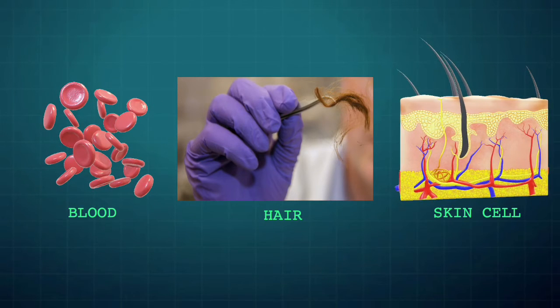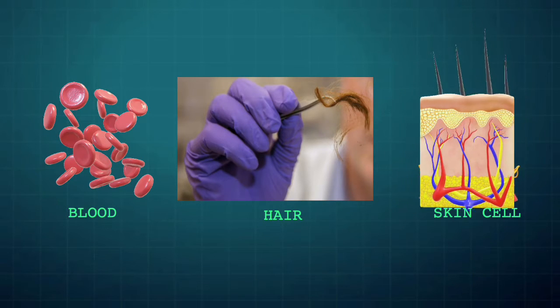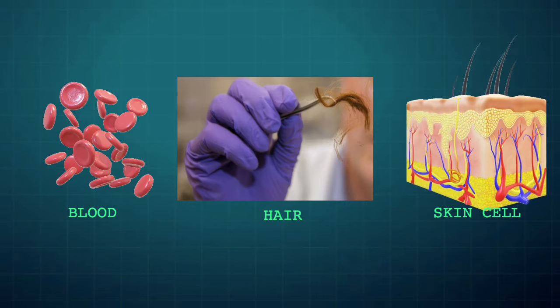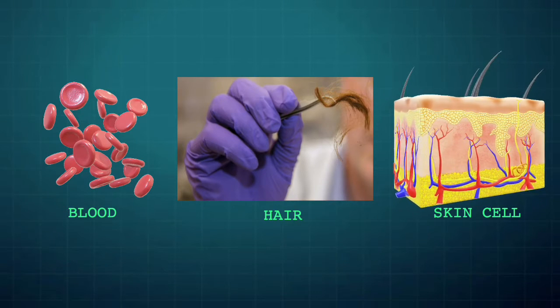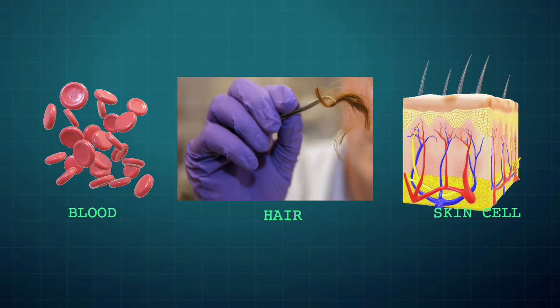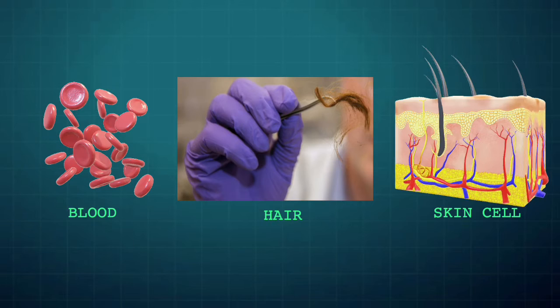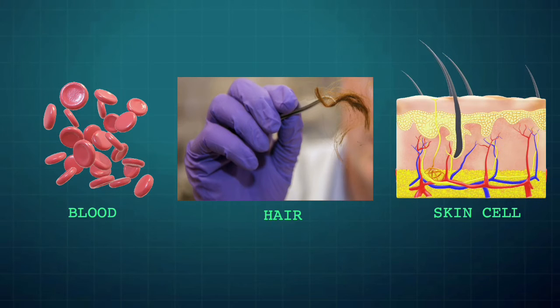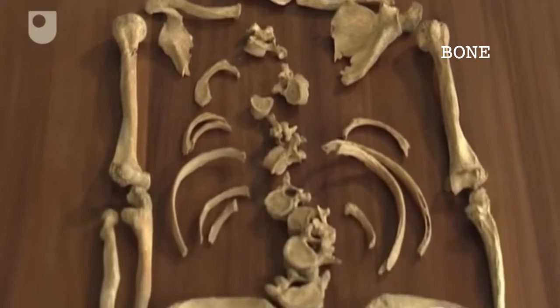Before the DNA profiling process is carried out, the DNA has to be amplified using the PCR reaction. Remember, PCR is the polymerase chain reaction, in which we take a strand of DNA and multiply it many times, so that we have many copies to work with, and in case some get damaged, we have many backup supplies to work with.